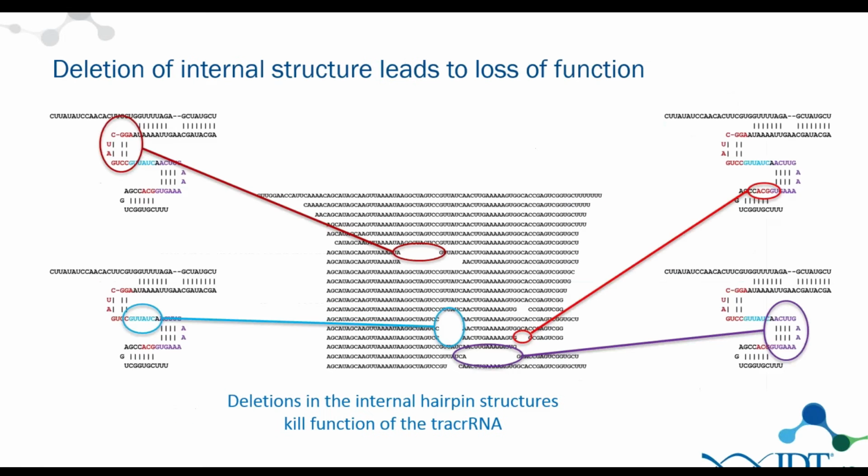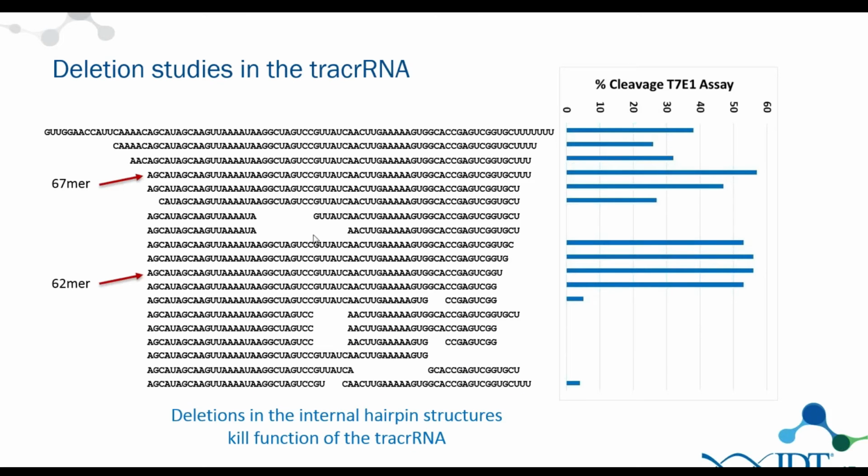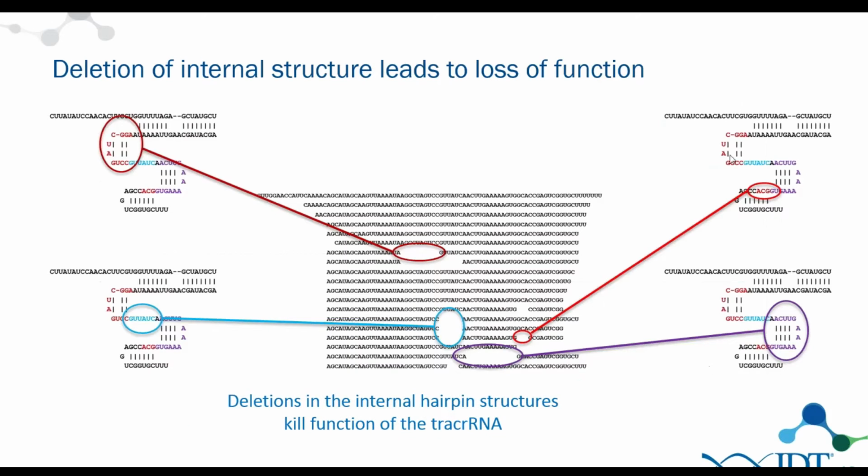Next to the sequences on the outside, we also looked at potential internal deletions, and from what we knew about the molecules, what we read in literature, and just by talking to our collaborators, we came to the conclusion that changing some of the internal structure of the tracer RNA highly compromises the efficiency of the sequences. So here you can see on this slide that we really designed the tracer RNA sequences and then modified them internally to figure out which parts of the sequence were really crucial for the work performed with the CRISPR RNA sequence.